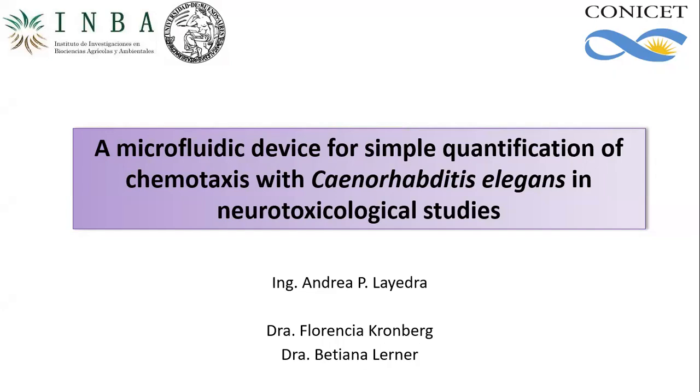I am a PhD student, and my doctoral research focuses on studies in C. elegans through the applications of microfluidic devices. The study that I'm presenting today is called a microfluidic device for simple quantifications of chemotaxis with C. elegans in neurotoxicological studies.